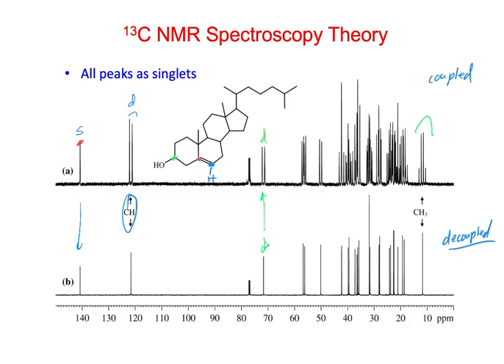And so that is, I think it's this one here, for one of the methyl groups, right? 3 protons attached, N plus 1 gives it a quartet. So this is a quartet. I was just looking through here. It looks like to me that maybe this one right here might be a triplet. You know, and again, it gets decoupled to a singlet.